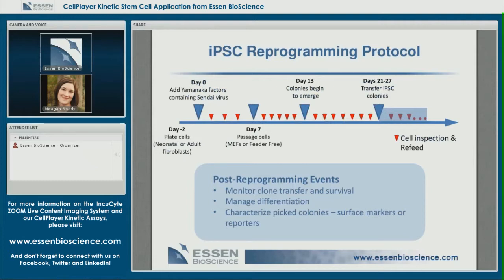Looking down the road to post-reprogramming events — utilizing Zoom you can continue to monitor your colony transfer post-selection and the survival of those pieces of colony. It's widely suggested that if you pick a colony that is not pluripotent at the time of selection, it will completely differentiate within the first several passages. You can continue to image, track pluripotency and differentiation. Whole well images were scanned daily to check for evidence of differentiation in pluripotent cultures, and I also used it to monitor colony growth to prepare for passage.